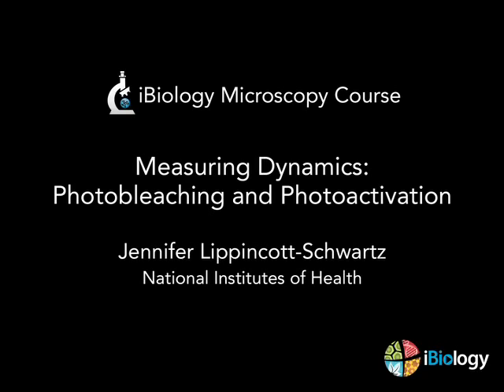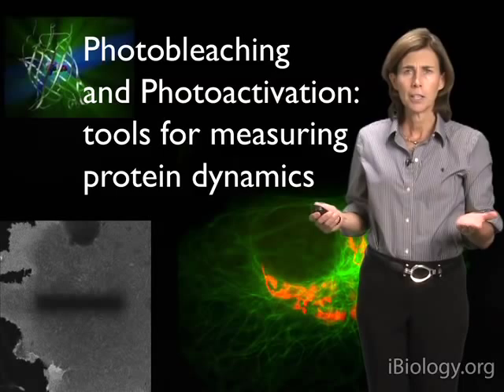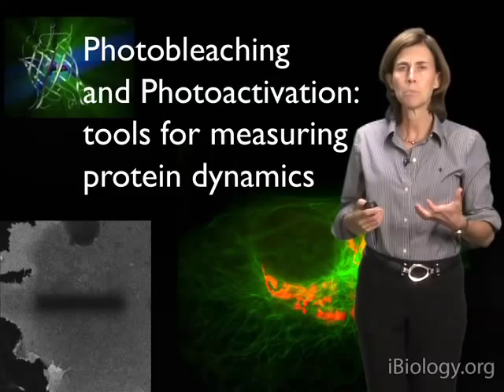My name is Jennifer Lippincott-Schwartz, and today I'm going to talk to you about photobleaching and photoactivation as tools for examining protein dynamics within cells. Starting with photobleaching and ending with photoactivation, we will discuss how these different techniques for imaging fluorescent proteins within cells can give us new insights into how molecules behave inside living cells.